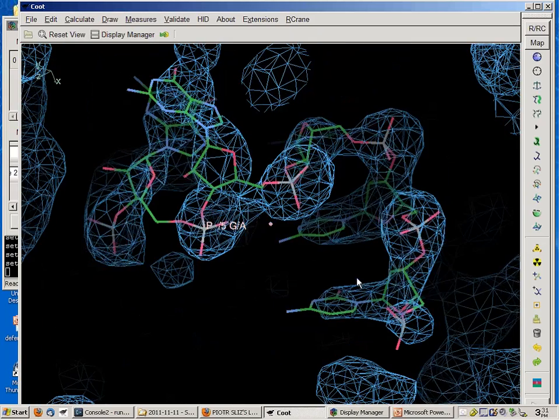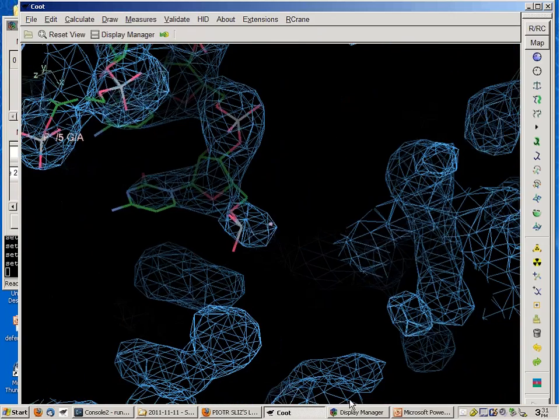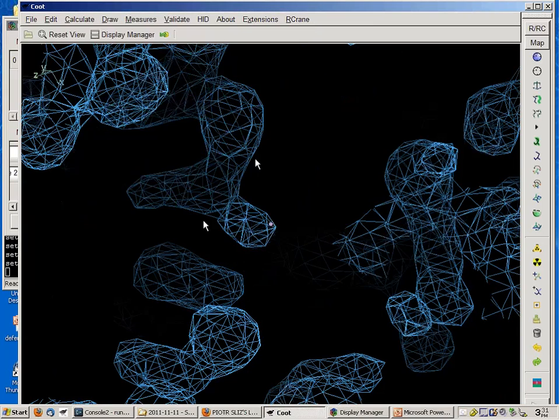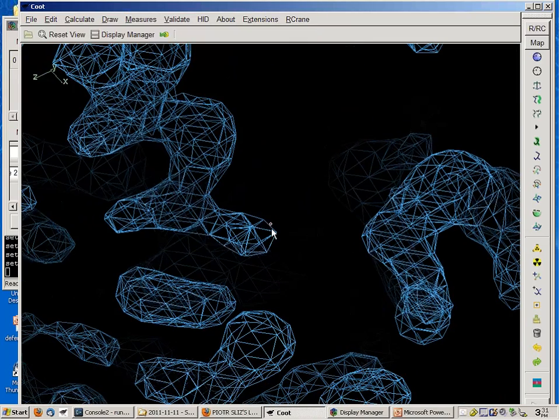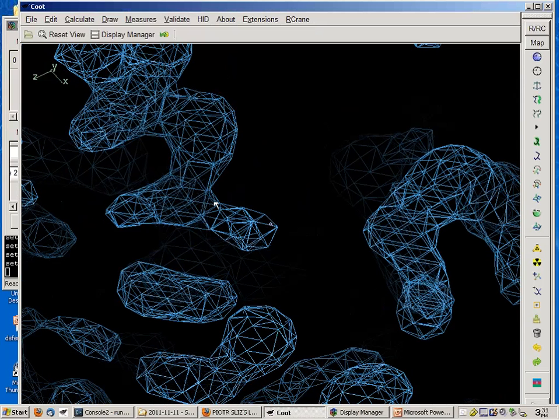To go back and trace and show how to pick the central phosphate again, I can actually show 2 things while I'm doing that. So to build the first phosphate, the first thing you do is drag your Coot screen center. That's this little pink dot. Just drag it somewhere near where you think there's a phosphate.